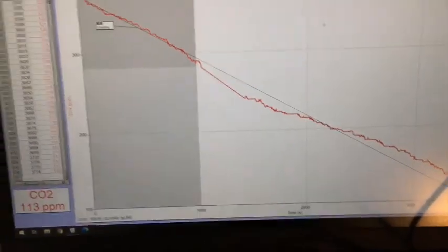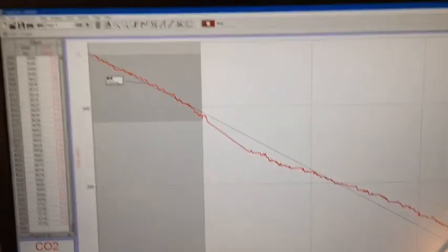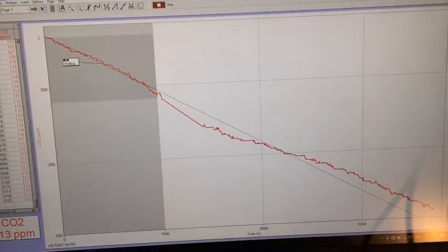I have printed off a lighter blue on a transparency, so I'm going to see if that affects the luminosity in a moment here. The red right here was great. The red was really good at photosynthesis. You could see a clear decline. We're at 113 parts per million right now, and we were at about 400 before. So we are seeing a pretty good decrease in sequestration after about 4,000 seconds. The lux is pretty comparable when it comes to the green and to the red, but the blue is kind of out of the picture here.